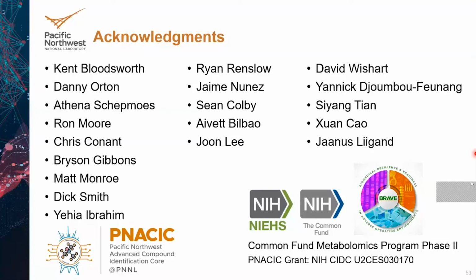The rationale to select the compounds is what I mentioned already a little bit. We don't just want to measure all the metabolites that are present in central metabolism. We don't want to focus on amino acids, small organic acids, fatty acids, lipids, and so on. We want the gnarly-looking compounds that come from microbial or plant secondary metabolite production, or from anthropogenic sources: flame retardants, pesticides, pharmaceuticals. We'd like to be as diverse in the chemistry as possible.